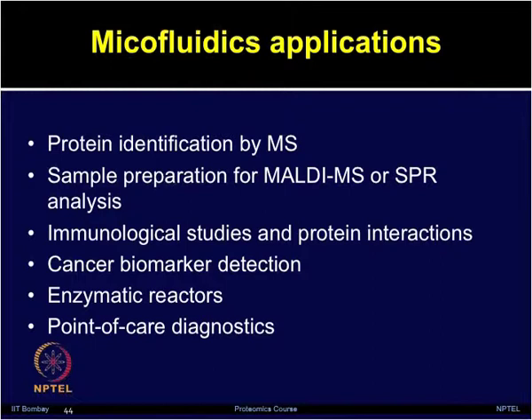It has been used for immunological studies as well as studying protein interactions, for different types of biomarker studies including cancer biomarker detection and enzymatic reactors. These are just a few of the microfluidic based applications.